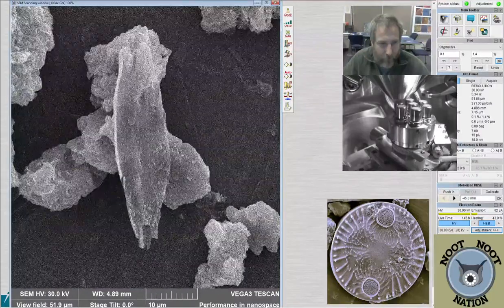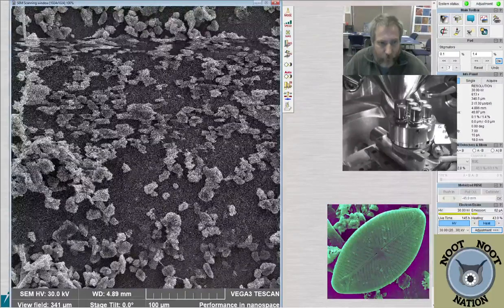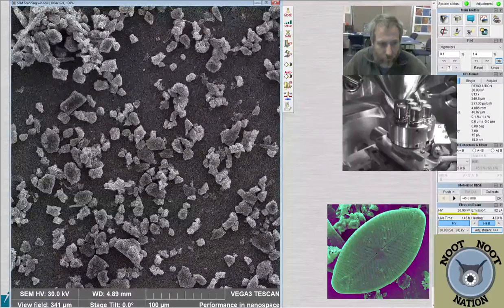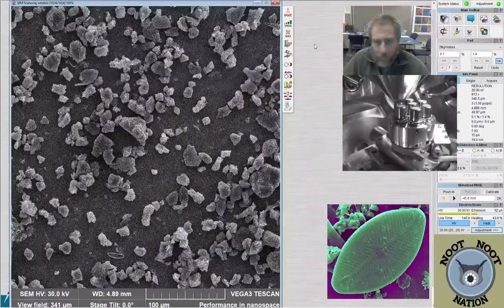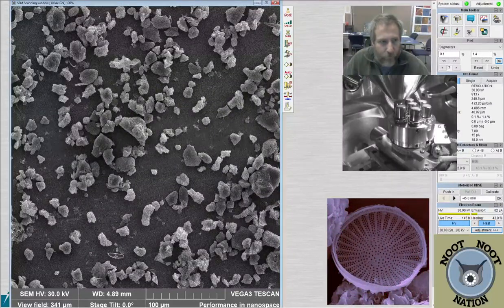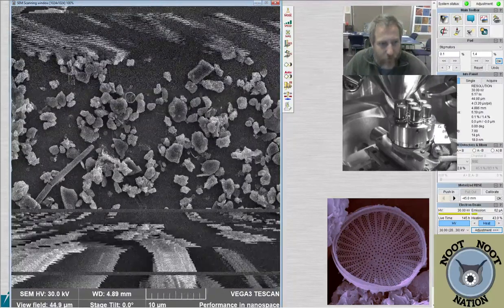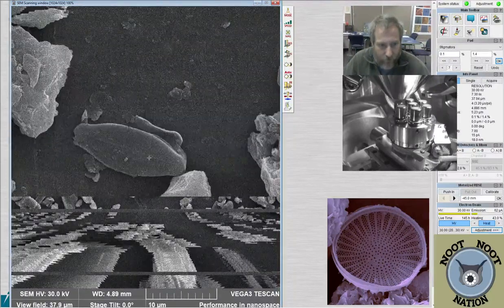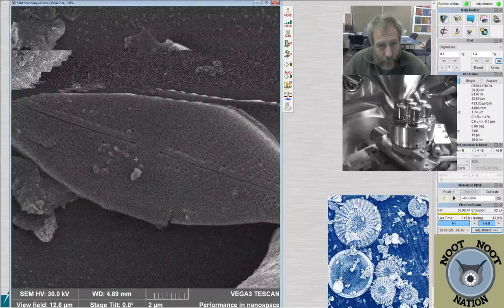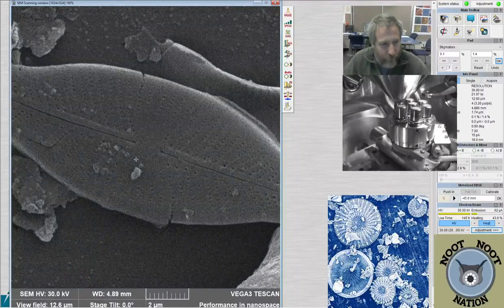It's another Nitzschia, two of them. There's a lot of mud on it, though. Oh, this is, there's something here. And I'll come back to that one as well. Not sure what the species is for this one.